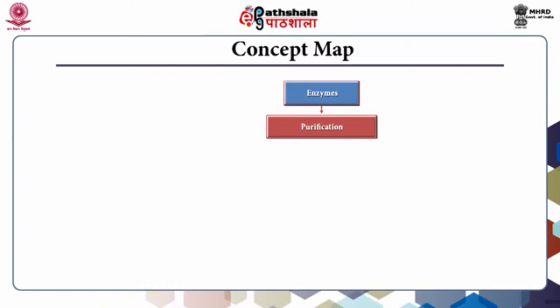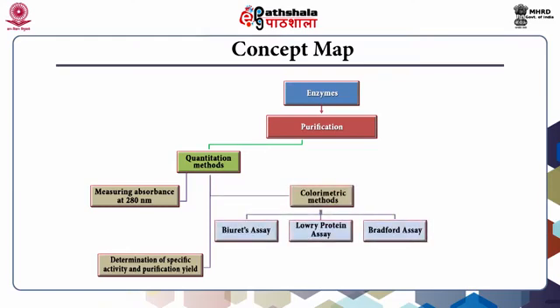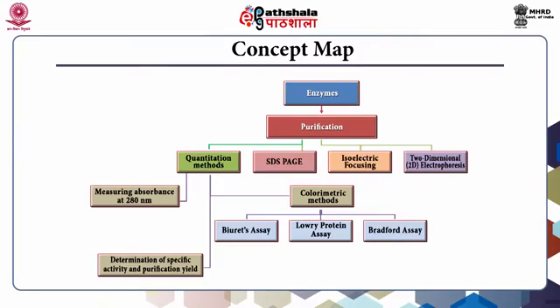We will first study the various protein quantification methods, which include the protein assay and determination of specific activity and yield. In the next session, we will cover SDS-PAGE in detail, spanning an understanding of the gel matrix, the role of SDS and buffer system, the electrophoresis, sensitivity of SDS-PAGE, application and the staining technique like Coomassie, silver staining and so on. We will also cover isoelectric focusing and 2D electrophoresis briefly in this module.